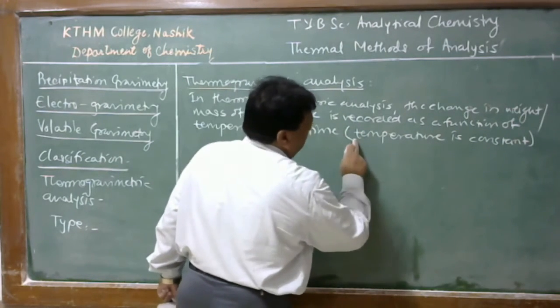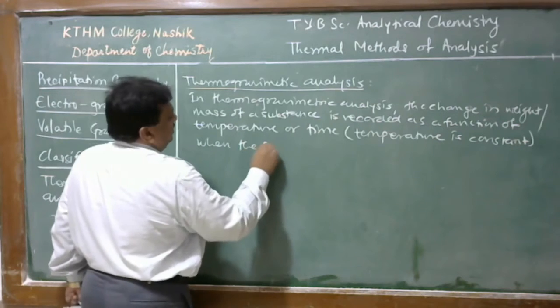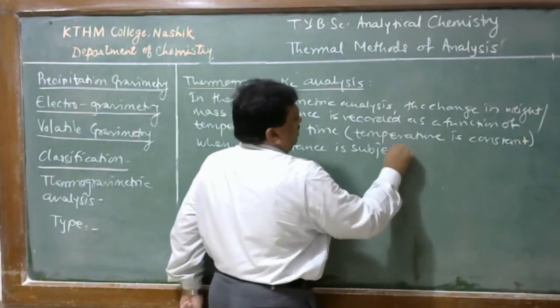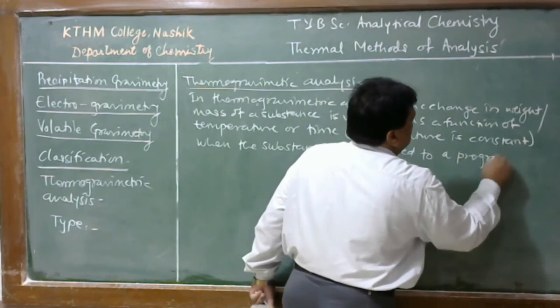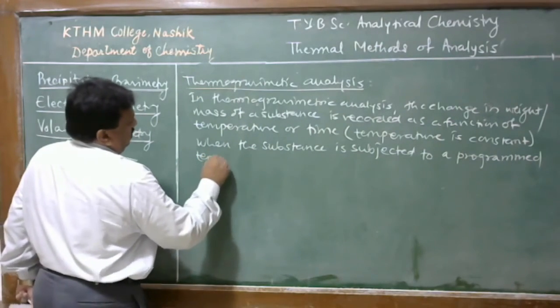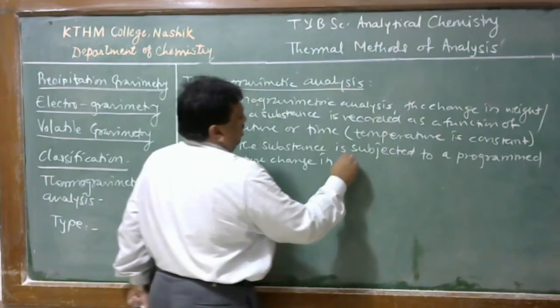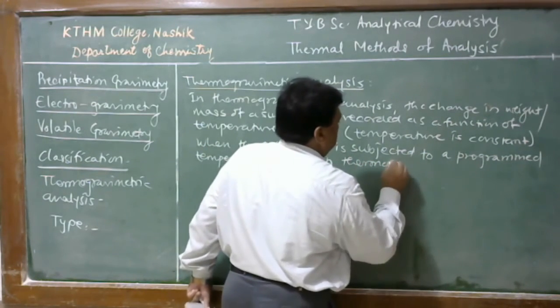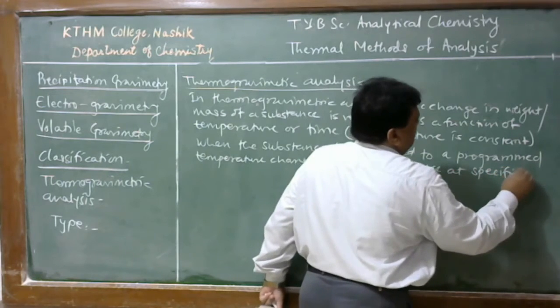Time means when temperature is constant, when the substance is subjected to a programmed temperature change in a thermobalance at a specific atmosphere.